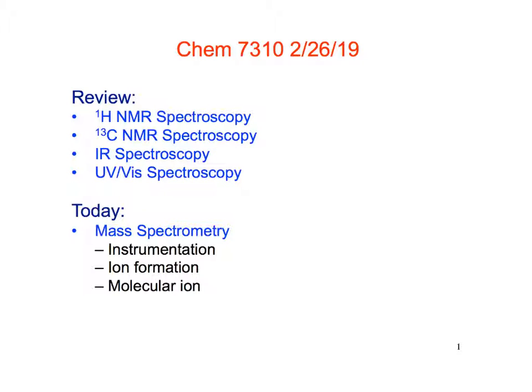I think the amount of time we spend, hopefully, is correlated to how much information we can gain from the technique, right, and how applicable it is. So I think mass spectrometry is a pretty good, useful technique.